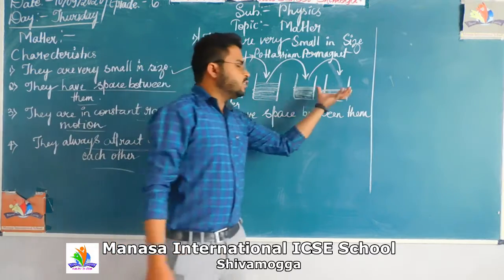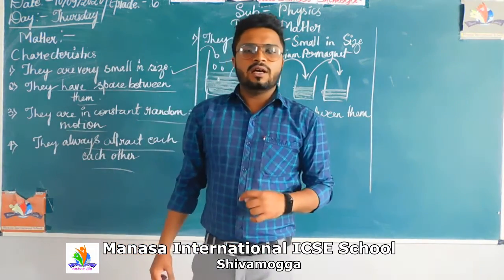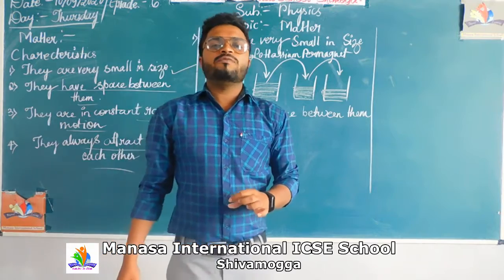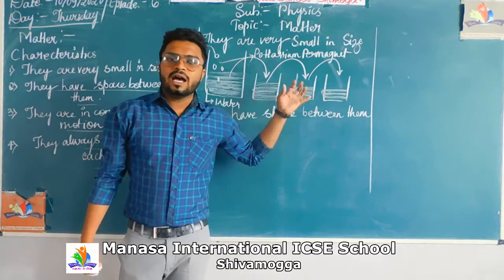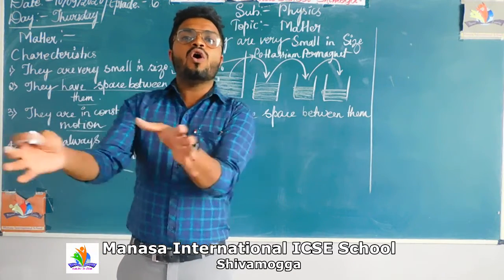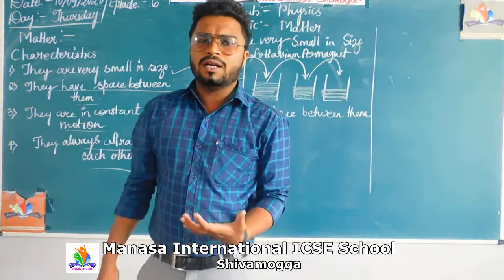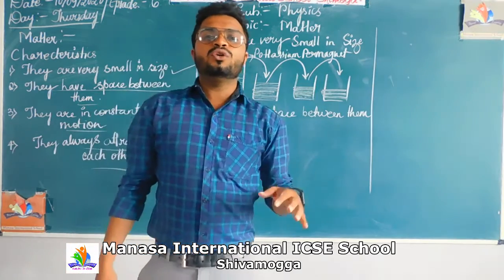And again from this, we have to drop 10 ml of the water. Again the color of this changes and becomes pale, light in color. Okay? This experiment shows that a tiny crystal of potassium permanganate can change the color of all the water. In a small crystal of potassium permanganate, there is a large number of particles. Those particles are mixing and it changes the color.